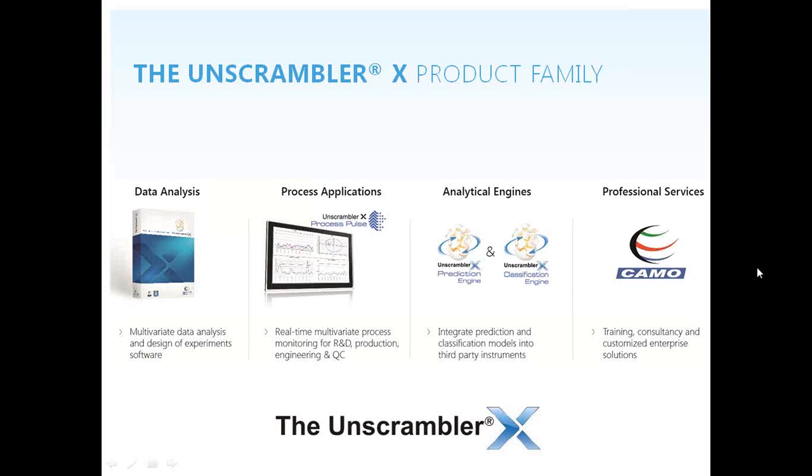We also have complementary software which allows the use of our Unscrambler models to be deployed in real-time analysis in a production environment through our analytical engines, which can be embedded into third-party software, and then Process Pulse, which is a standalone piece of software for real-time analysis. In addition, Camo has a full range of professional services, including consultancy to assist in model building, and we also offer training in multivariate analysis, as well as a complete range of IT solutions and customization.